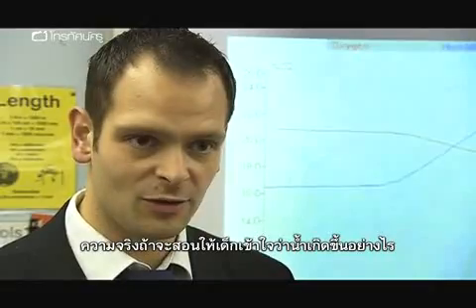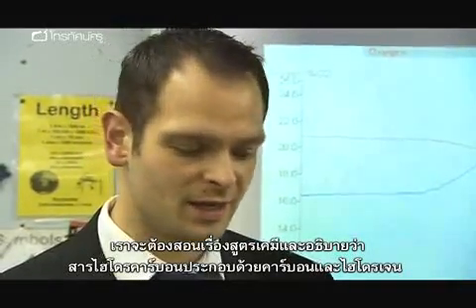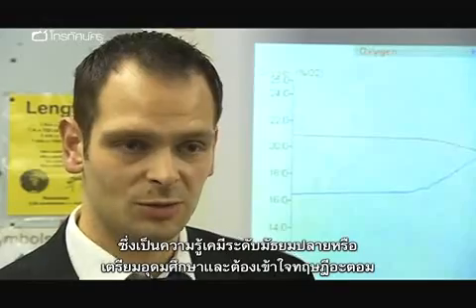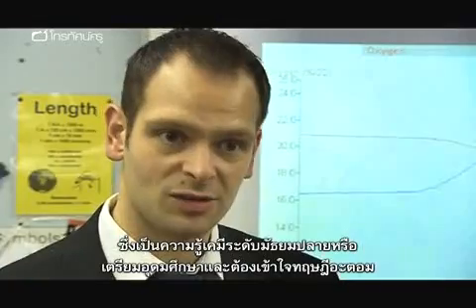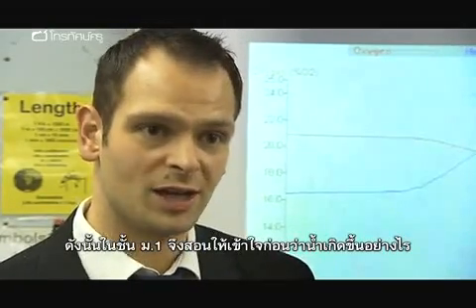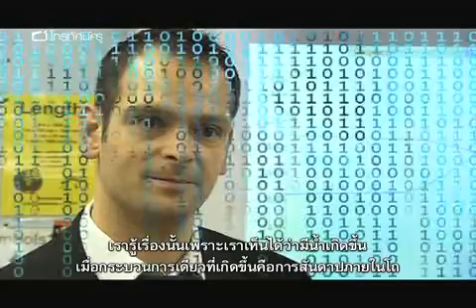In fact, to get the idea across that water is actually produced, you would need to go onto the chemical formula explaining how you got the carbon and the hydrogen in the hydrocarbon, and how the hydrogen will then react with the oxygen in the air to form the water. Now, that takes you up to GCSE, post-GCSE level chemistry, and appreciation of conservation of atoms. And until year 9, we wouldn't even get that far. So to do this with year 7s means they're already starting to appreciate that water is produced. We know that because we can see the sensor detecting water, and the only thing that's happening is the combustion inside the chamber.